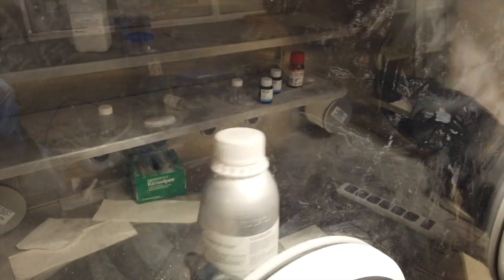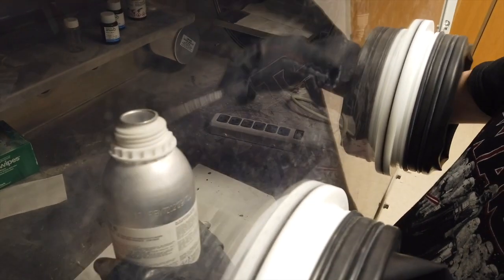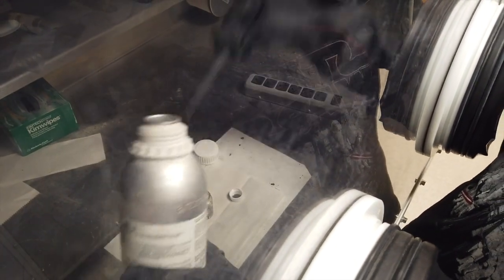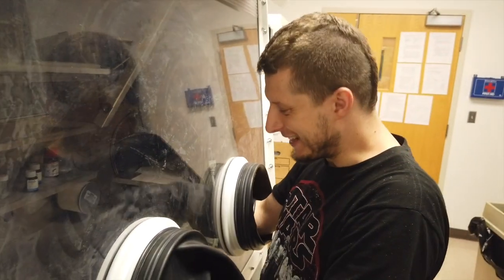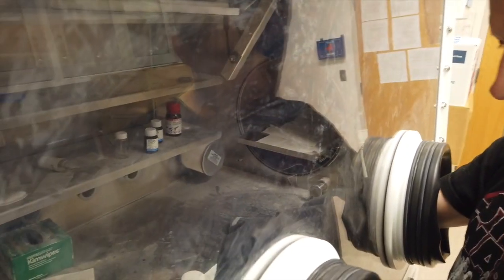And what I'm doing now in this argon atmosphere is placing the material from this bottle into my small bottle, and it will survive transport. Then I will take it out using a chamber similar to the one astronauts use on the ISS. You know, astronauts on the International Space Station, when they need to go out, cannot just open the doors, because all the gas will leak and everybody will die. So they need to go to a special chamber. They lock themselves in this special chamber, and we have it here. This transportation chamber does the transition between this amazing argon atmosphere and our human atmosphere.